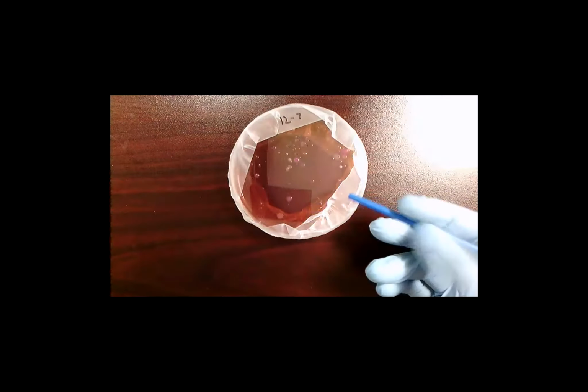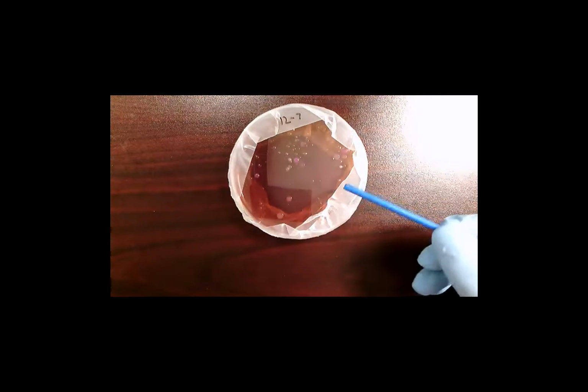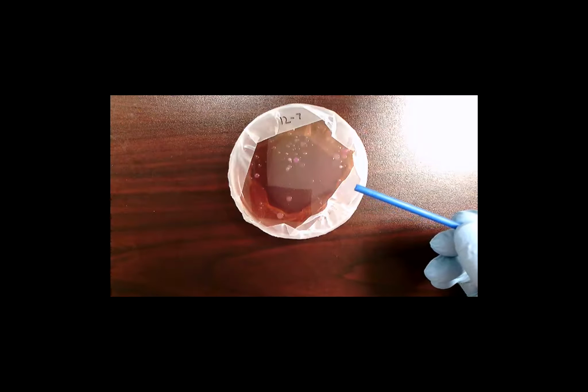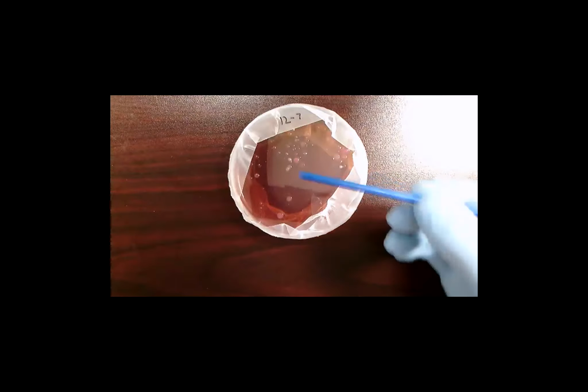One thing we'll talk about in a little while is each plate is plated with 250 microliters of water, and I'm going to give that information to the students the day of the practicum, and you have that information already that was sent out to you today, because that's going to be important for the calculations the students have to do to know what we plated, how much water we put on each plate.